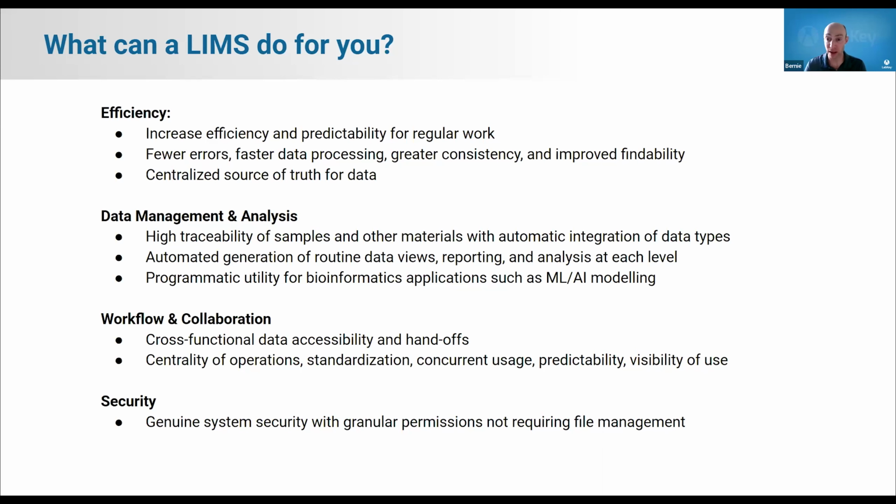They help keep track of data in such a way that finding it in the right context is a whole lot easier. For example, tracing samples and other materials to find out whether you have anything that meets particular criteria for a new project. LIMS will feed you useful views of your data for all kinds of purposes, including things like local scientific operations. As one scientist or a small group of scientists working through these operations, it will help you with the steps. Aggregation of experiments, project level team decision making, management or executive review of things, as well as regulatory affairs compilations.